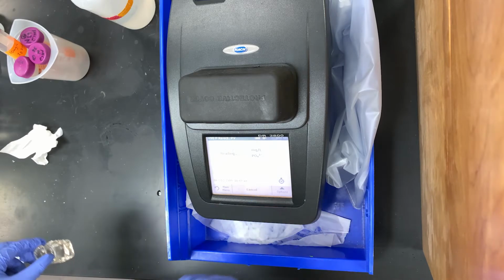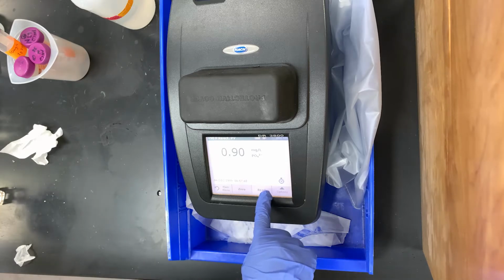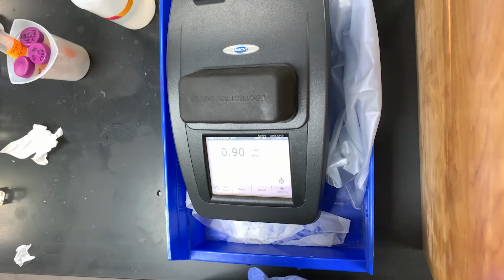So for our 10 milligram per liter standard phosphate, we're getting a final concentration of 0.9 milligrams per liter of phosphate. So now I'm just going to organize all this data in Excel, and I'll do a quick tutorial on the calculations you'll be doing in this assignment.